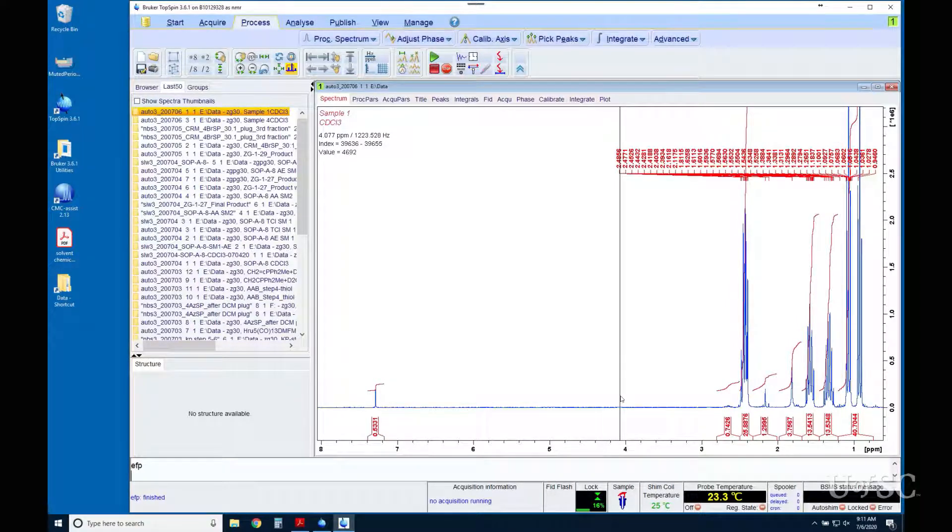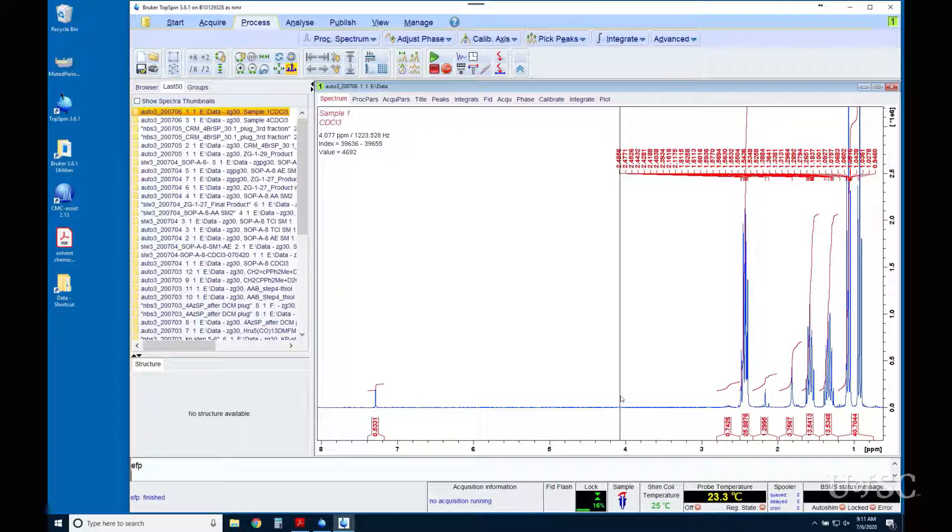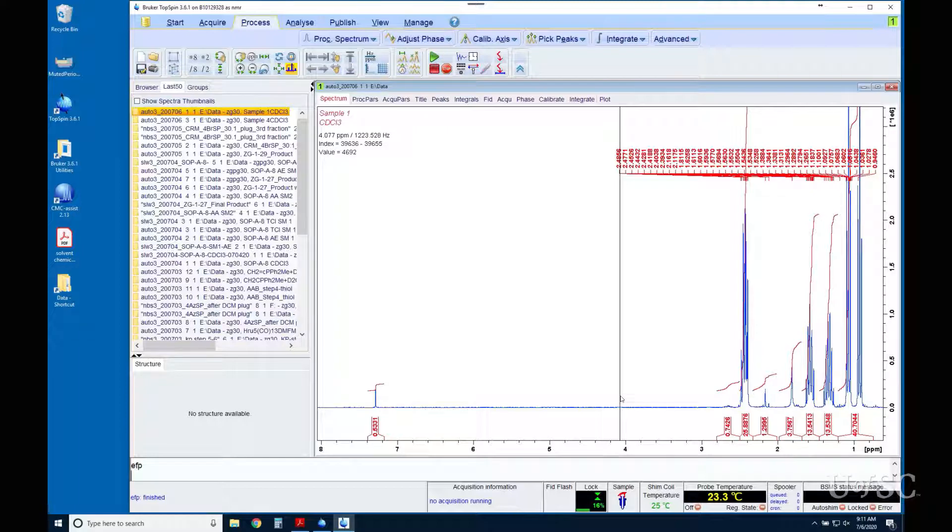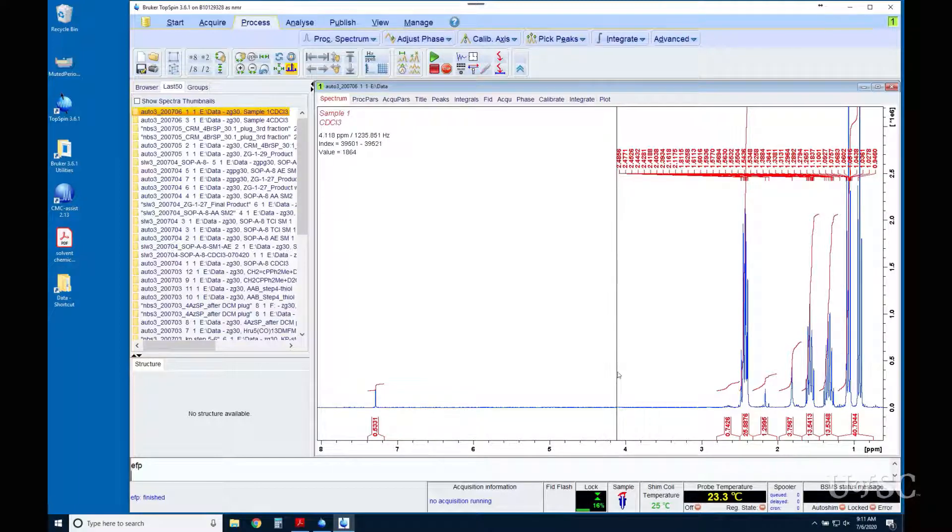The F stands for Fourier transform. This has to be performed to take the raw time-based NMR data and convert it to the frequency-based spectrum that can be read. We will see this clearer in a moment.